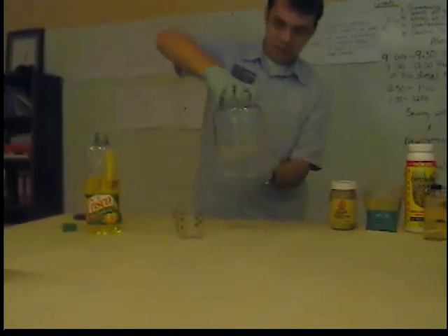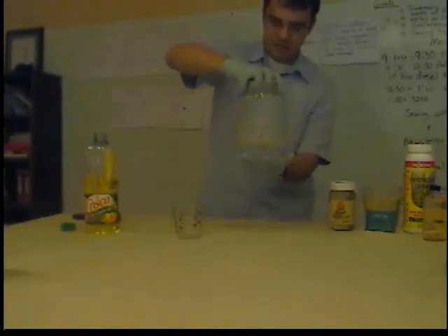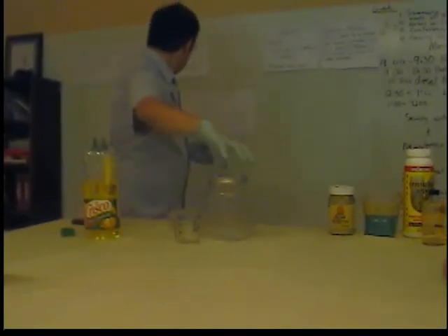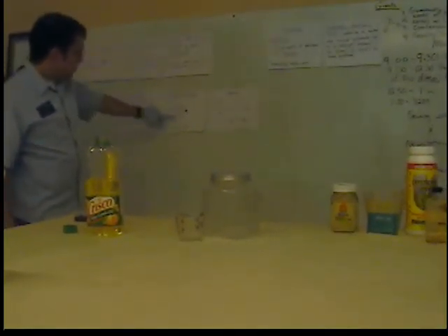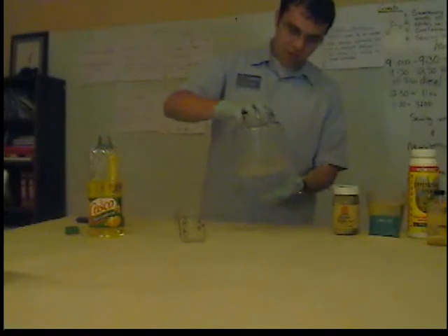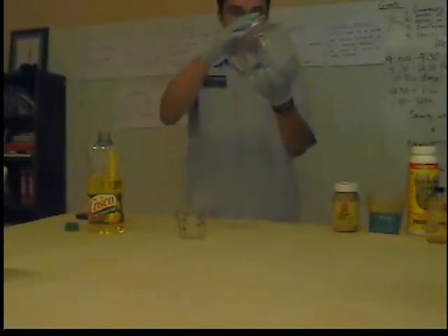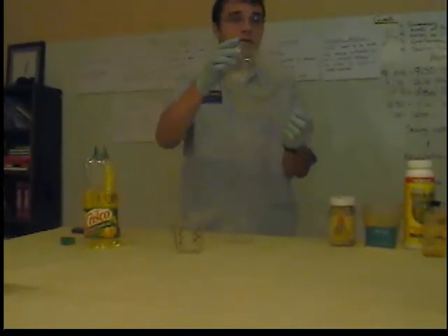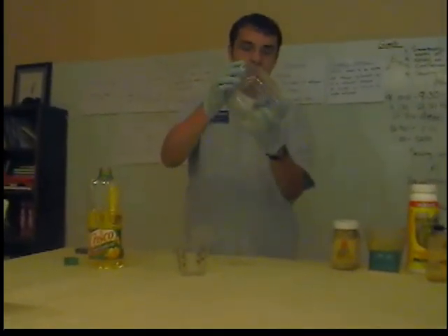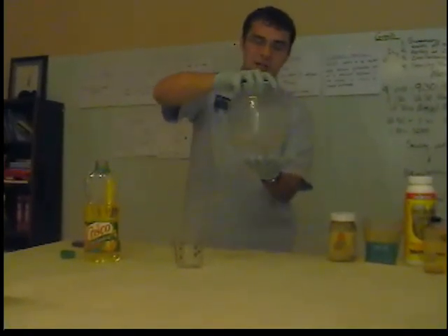It's actually heating up. It's something called an exothermic reaction, so it heats up. Right now I'm mixing — I haven't touched my triglyceride yet, but I'm taking both of these and mixing them together, so I'm ready to start this process. Why does it heat up? The reaction between the methanol and the sodium hydroxide creates energy because the bonds are ripping apart and forming new bonds, and as a result of that it's releasing energy. That's why in this case it's exothermic.